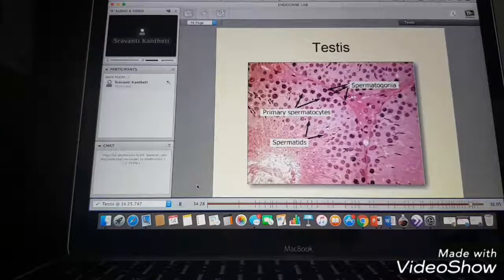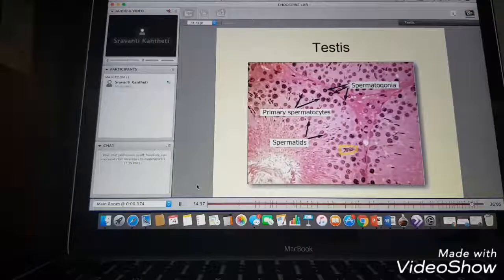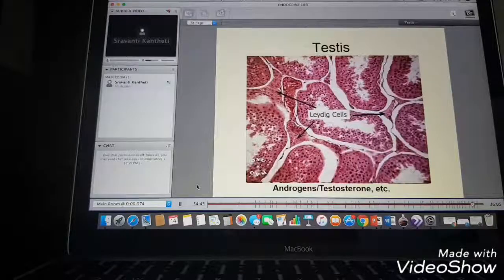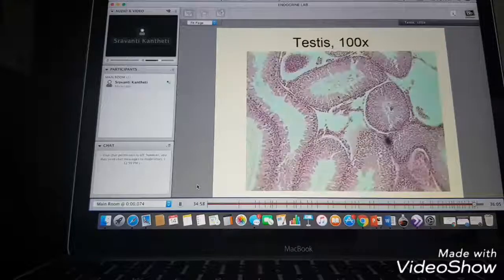And when you look at a close-up of the testicular tissue, you can actually see little sperm. Look at that. Oh, how cool. See? So you can see sperm in every phase. Pretty awesome. And these are Leydig cells, which secrete testosterone, and that is the specific endocrine function that we're looking at. You know, we're not so concerned about the sperm in here. That's the reproductive chapter. But we're looking at the cells that are going to have the endocrine function.